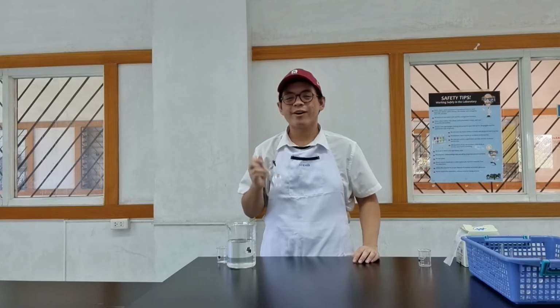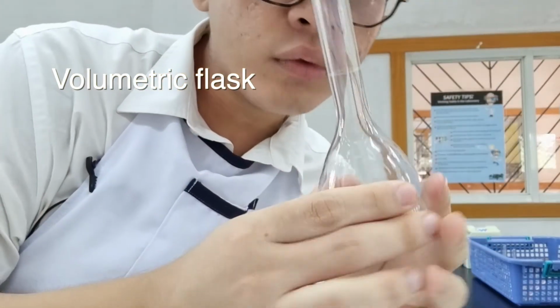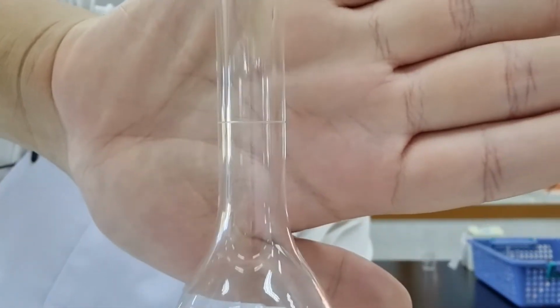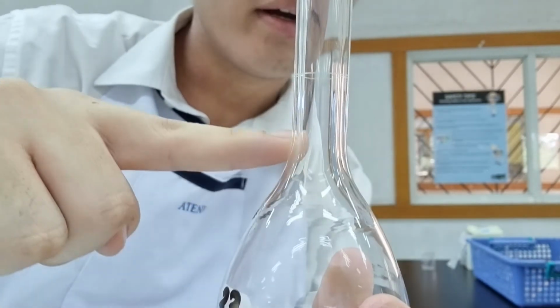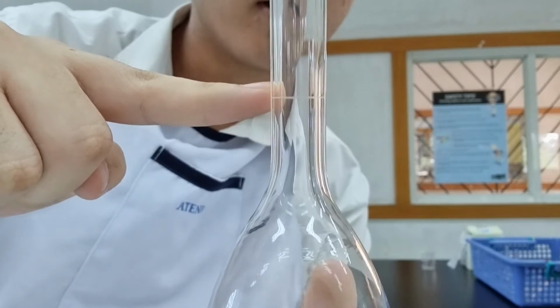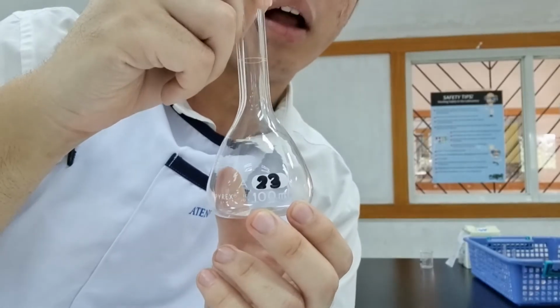Here I have a volumetric flask. Here it is up close. So there is only one mark, can you see it? There is only one mark on the volumetric flask. If we fill this with liquid, and the meniscus would reach this mark, then we could say that we accurately have 100 ml of liquid.